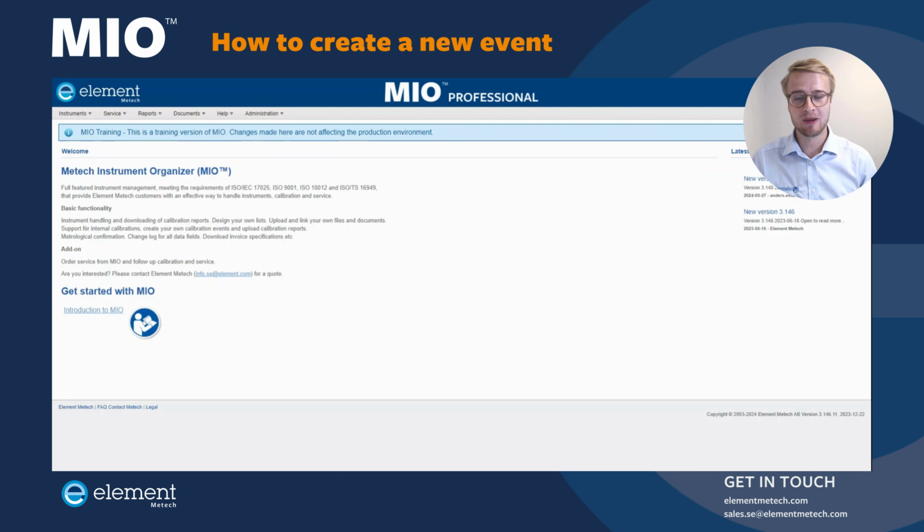I'm going to show you how you can create your own events in Metech Instrument Organizer. So the first question might be, what is an event? An event is an activity for an instrument, which for example can be a calibration, repairment, modification, or a delivery inspection. And I am going to show you now how you can create a calibration event for your specific instrument.